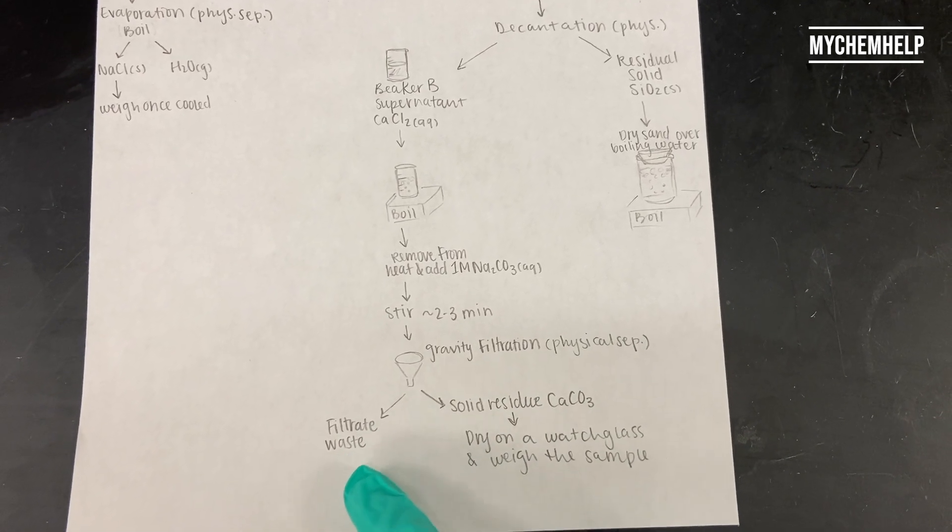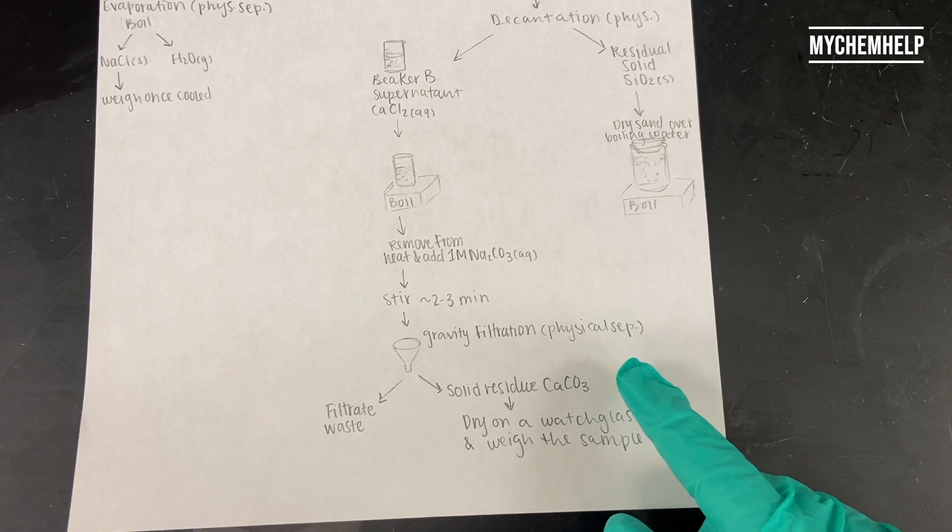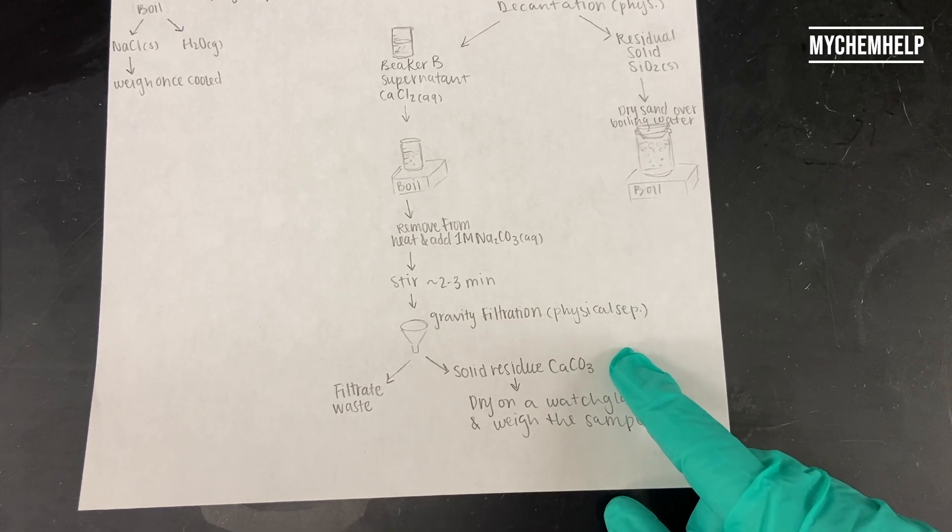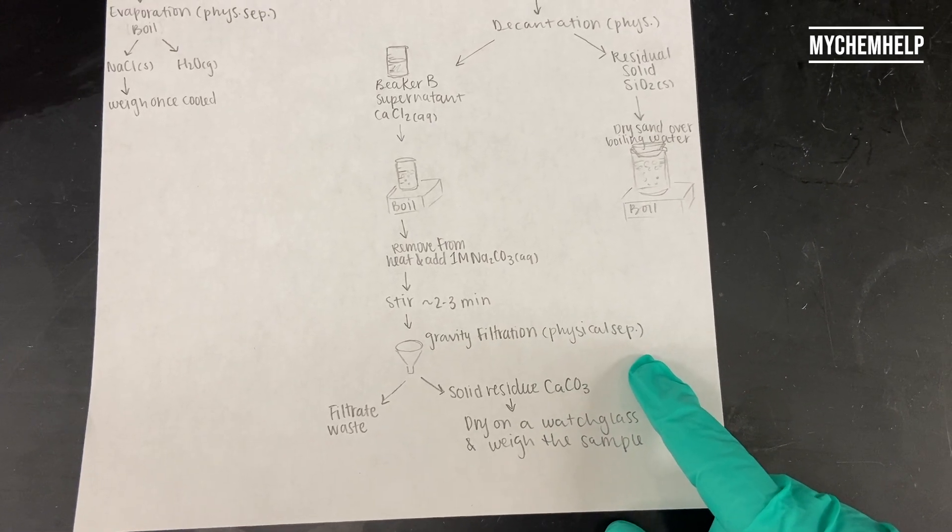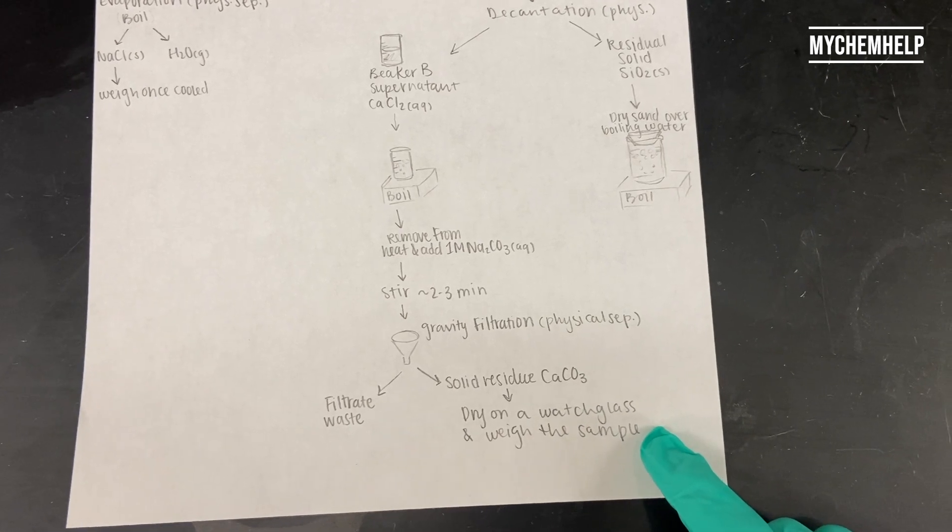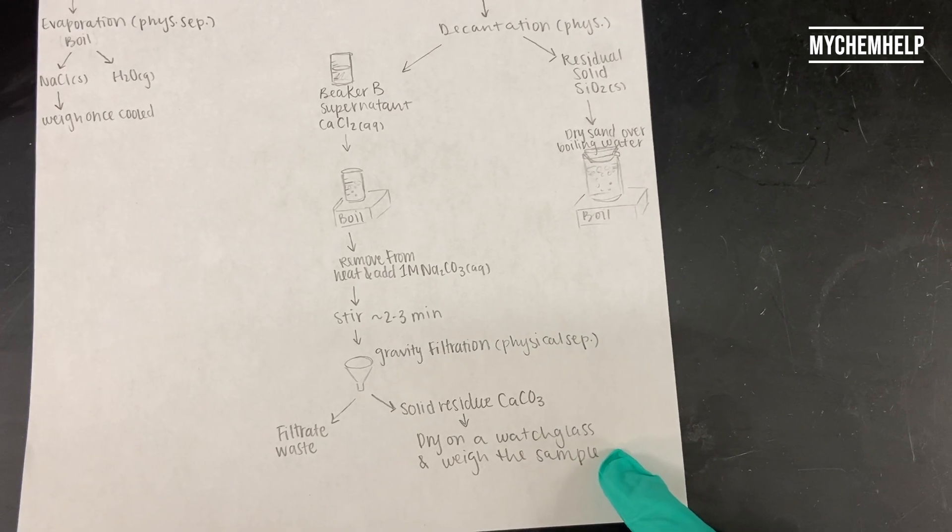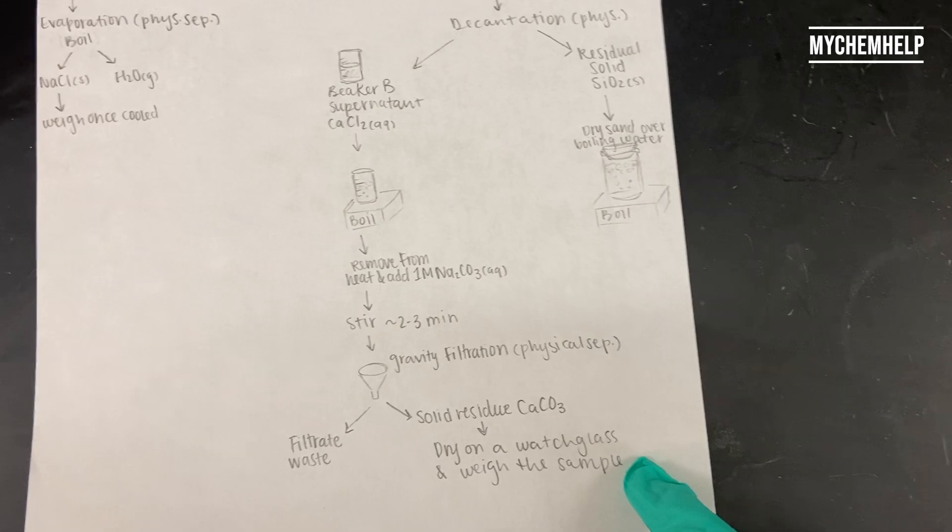The filtrate, the liquid portion, is going to be waste, and then the solid residue is going to be our calcium carbonate. We're going to transfer that onto a dry wash glass, and we're going to dry that further and weigh out the sample.